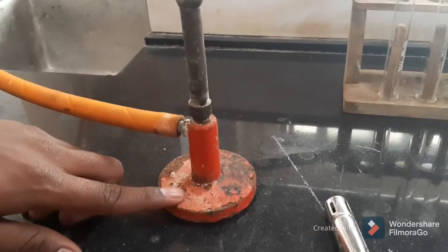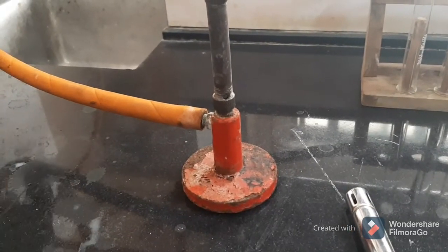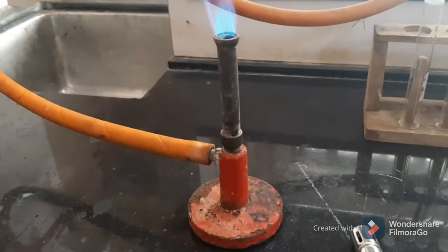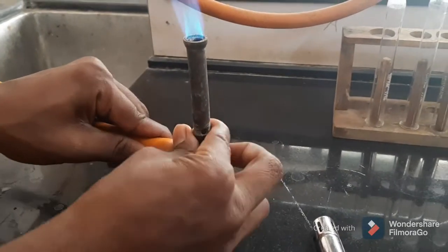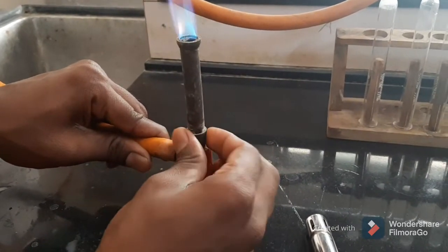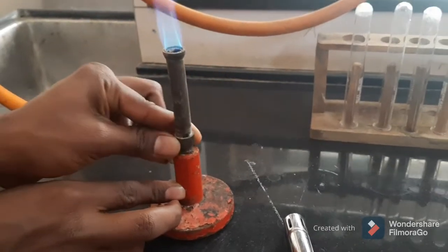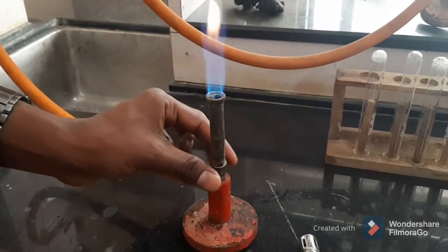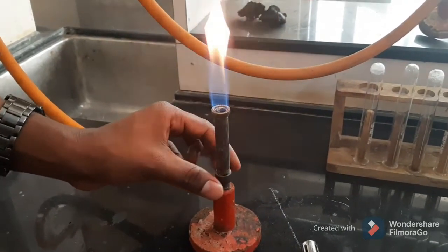This bore is surrounded by a metal collar, by using which the bore can be opened or closed. When we close that bore, the oxygen supply will get reduced.